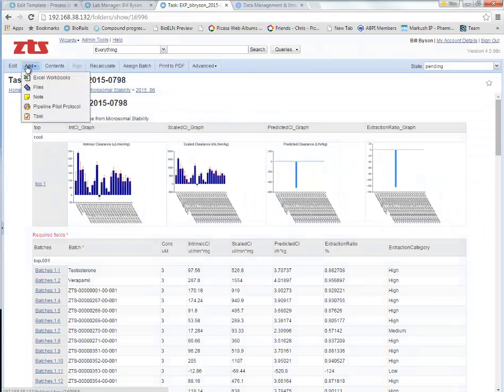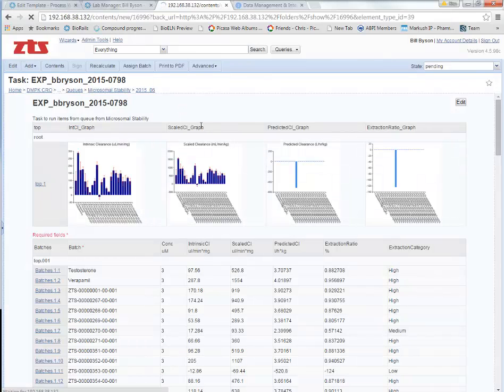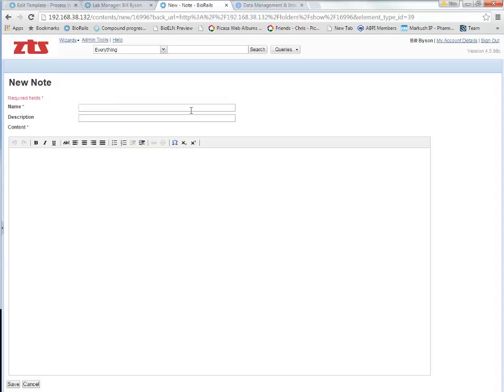Of course at this point I might want to add my conclusions to the study. So I'll add a conclusion and we'll say okay, and we'll just add that conclusion to it.